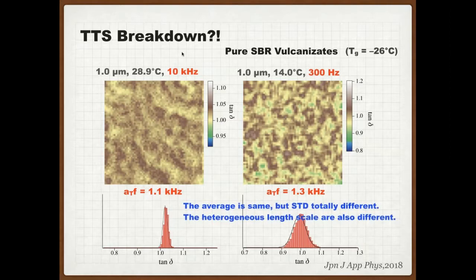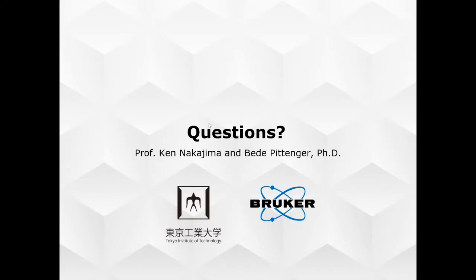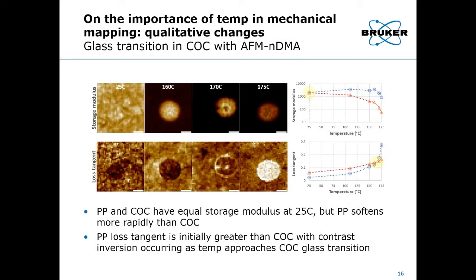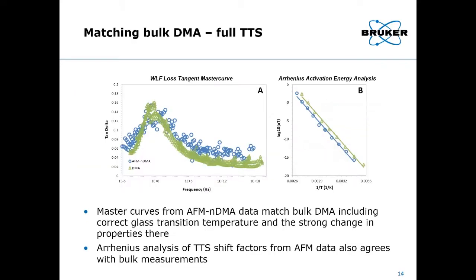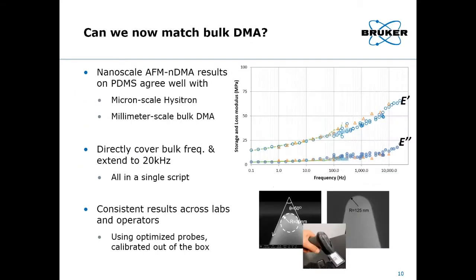special pre-calibrated probes for these measurements, which have a vibrometer calibrated cantilever spring constant and also a specially manufactured tip, which is made to be very consistently cone-shaped, and we do individually SEM image these probes to determine the radius on an individual probe basis as well. I don't know if Beat wanted to say anything else there.